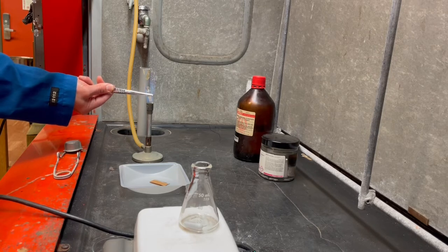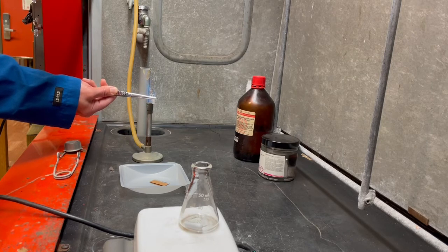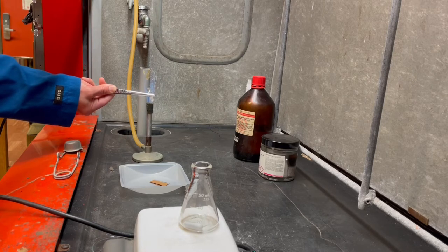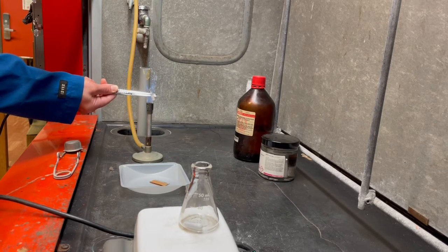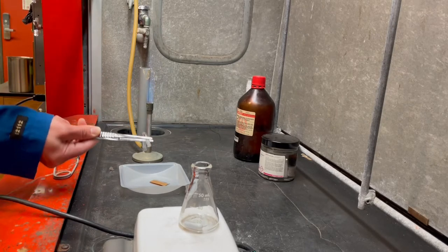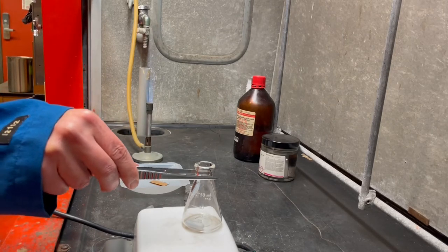But the reason why I'm hitting all this glassware with the heat is to get rid of any water that might be on it. And the reason we want to do that is so that the water doesn't react with our sodium ethoxide, because our sodium ethoxide can easily get protonated. If it gets protonated, then we don't have it available to react with the reagents we want.